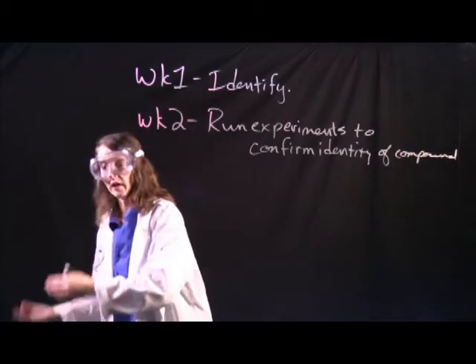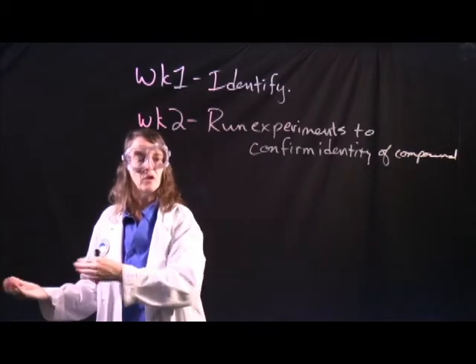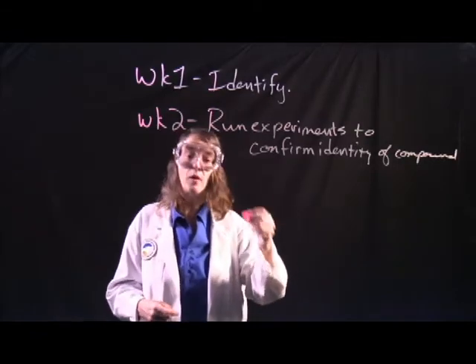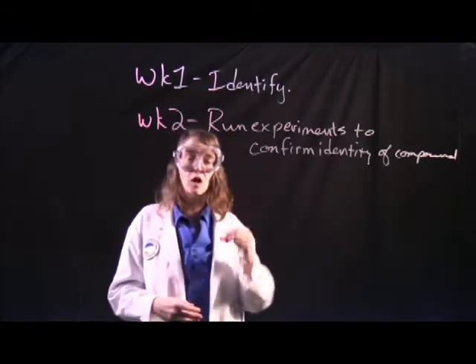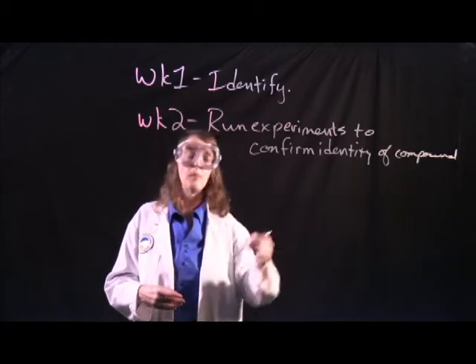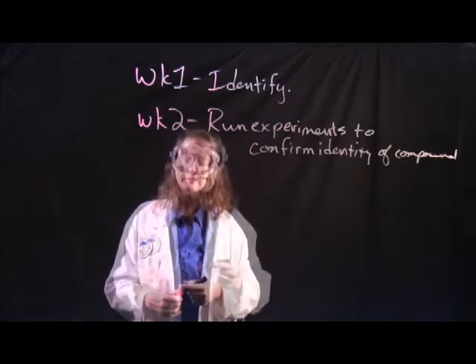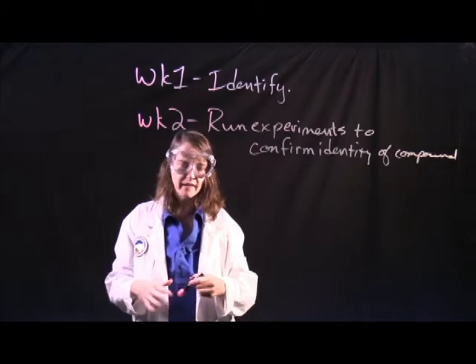Well, you need to look up the freezing point of solution for your compound and see, you need to probably determine the molar mass of your compound and compare that to the molar mass of the compound that is your unknown. Several things to keep in mind.